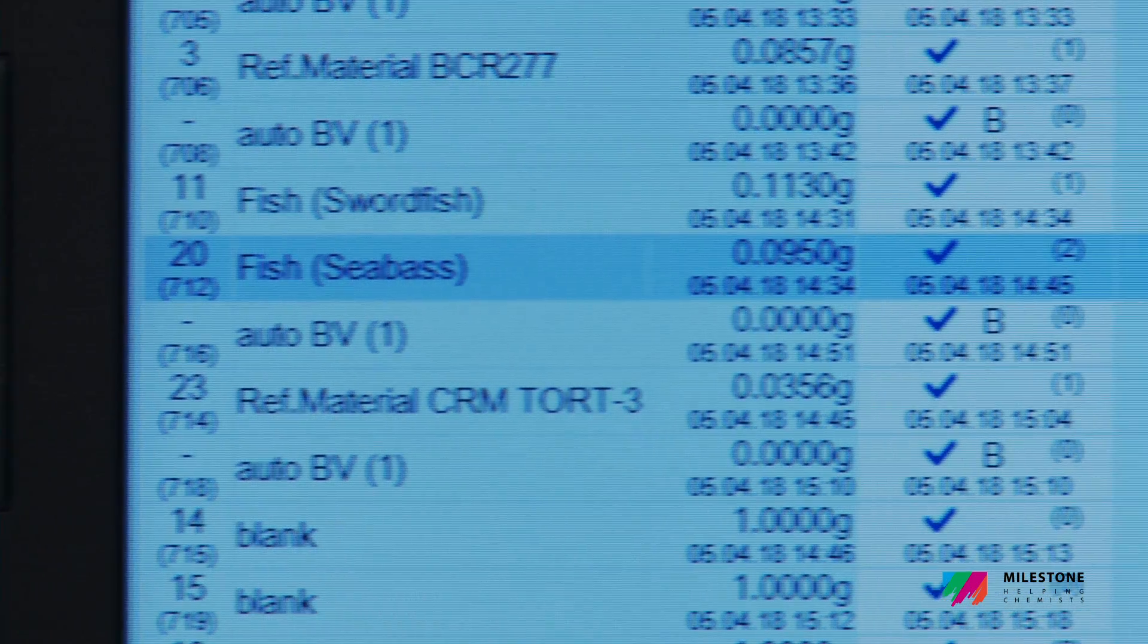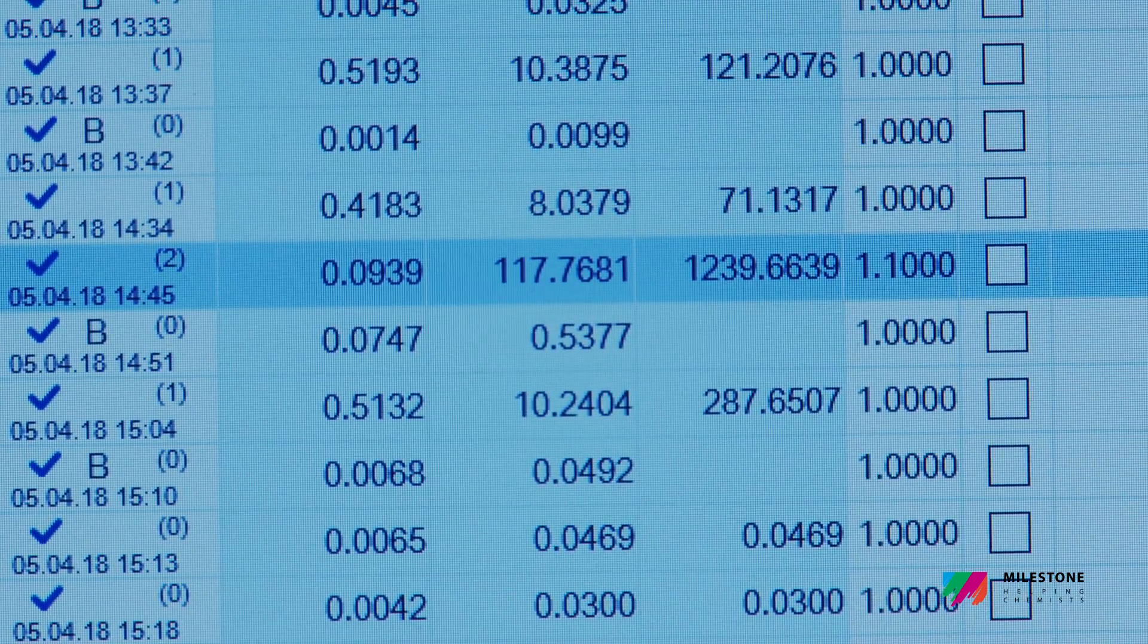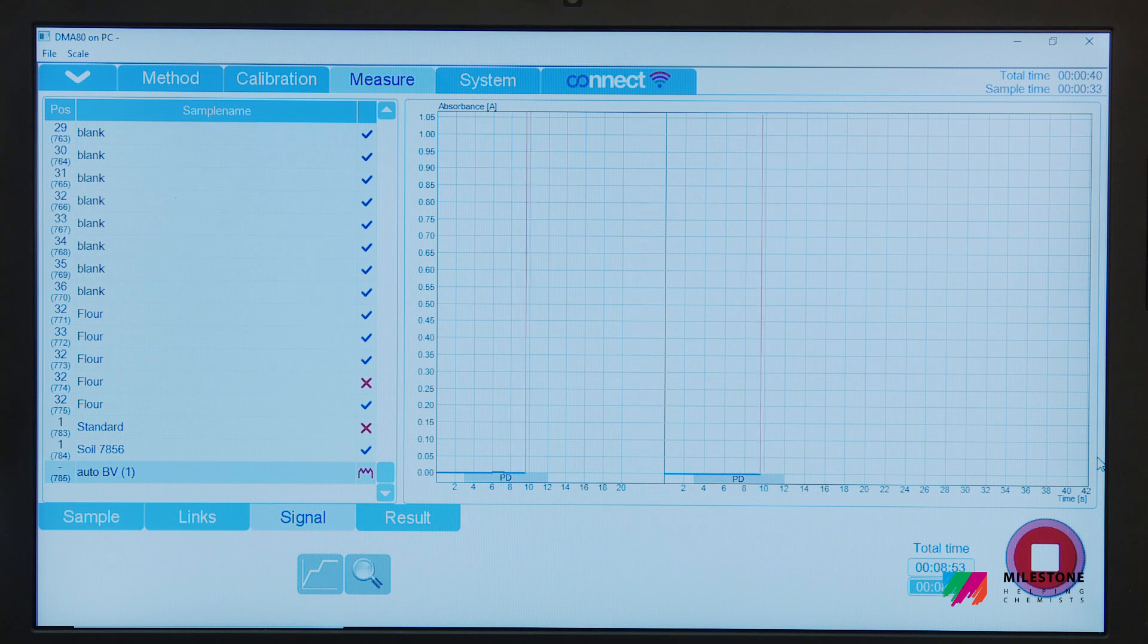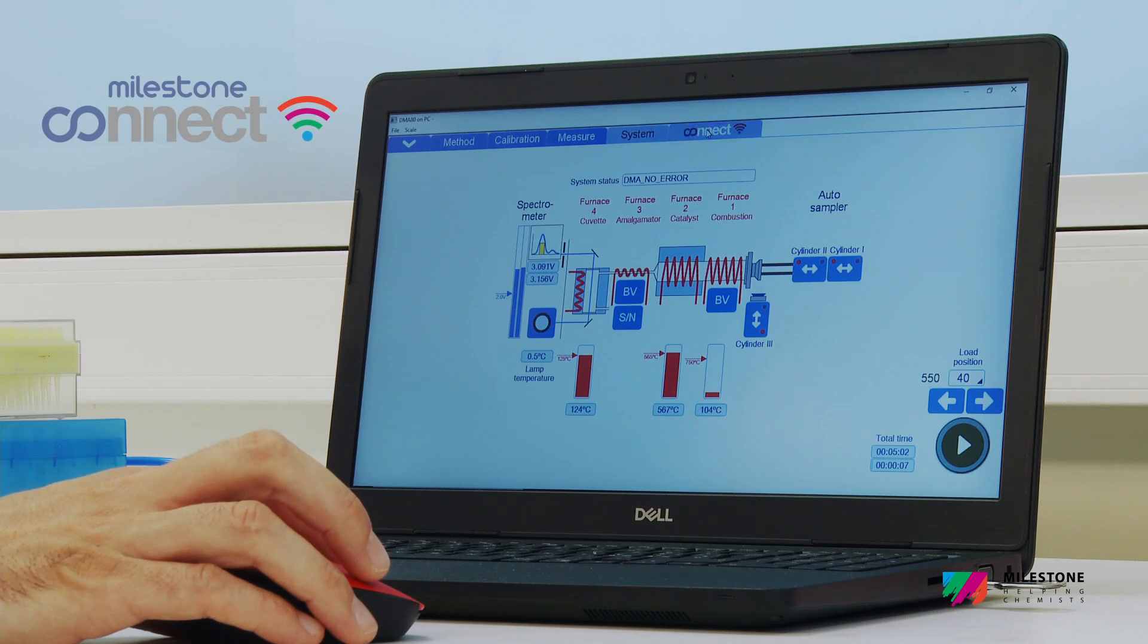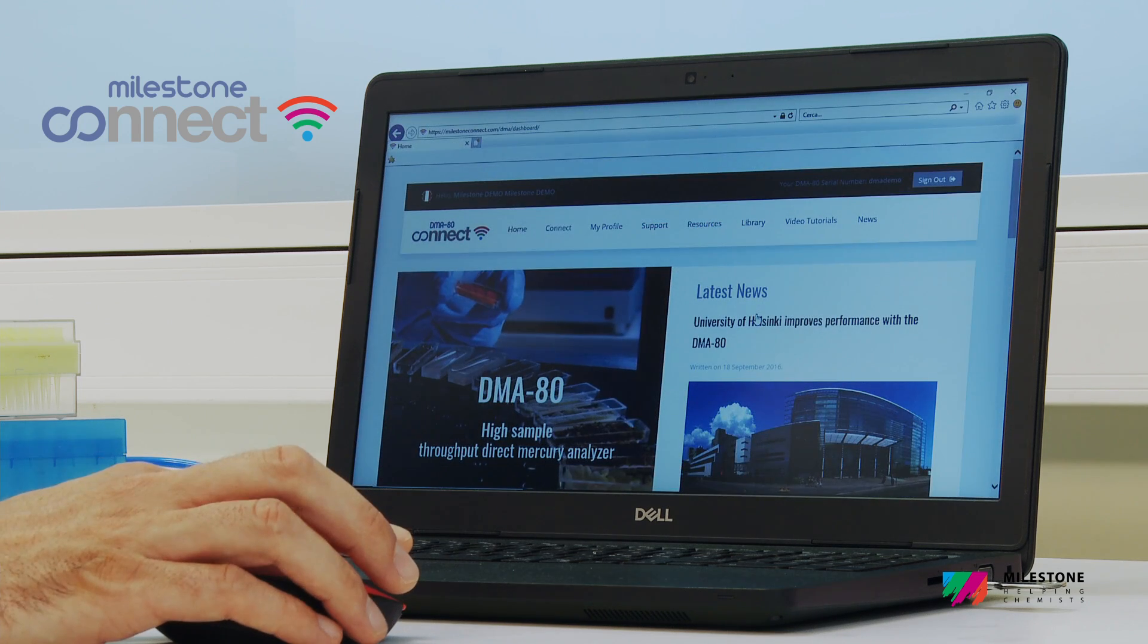Memory effects in mercury analysis have been overcome thanks to the auto-blank features, which will avoid overestimation and ensure low blanks. A unique web-based application is included with the DMA80 EVO.